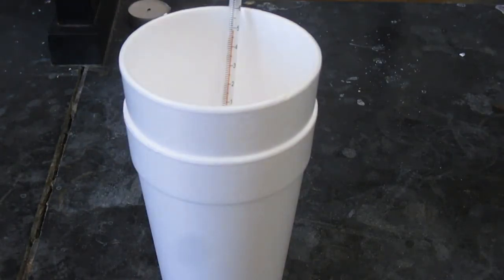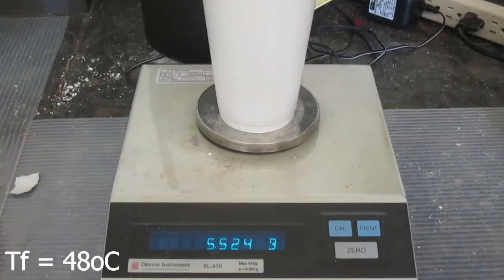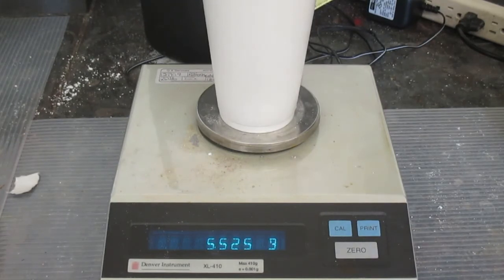All right, so all the magnesium has dissolved, and it has reached a final temperature of 48 degrees Celsius. Now what we have to do is react the magnesium oxide with hydrochloric acid.